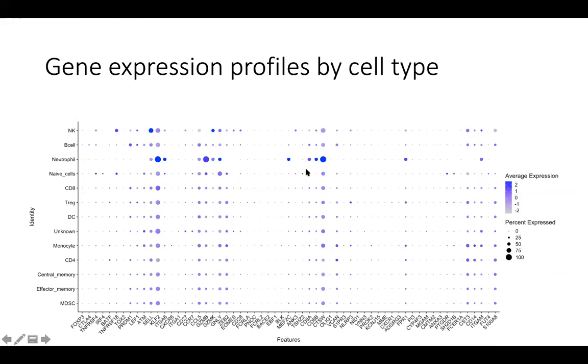Okay. The other thing that we can do is to combine single cell immune profiling data with gene expression data. What that allows us to do is to correlate gene expression changes with immune responses in the body or in the cell. And that is particularly interesting in cancer drug discovery, in immunology, and vaccine development.